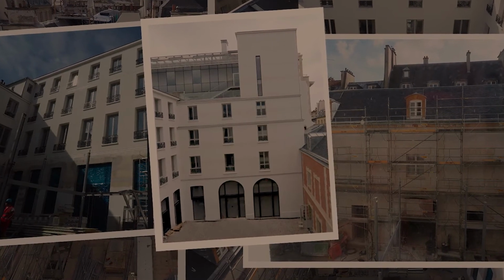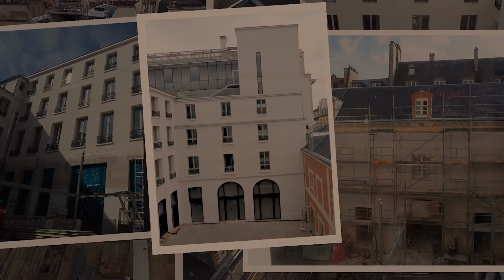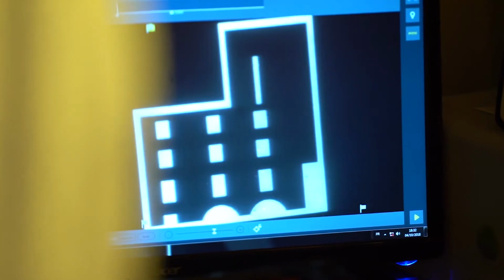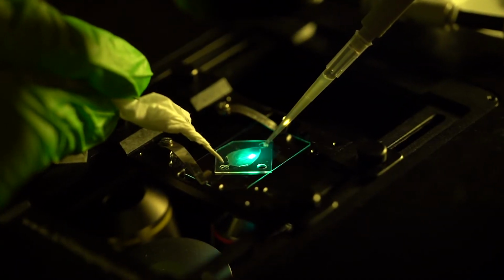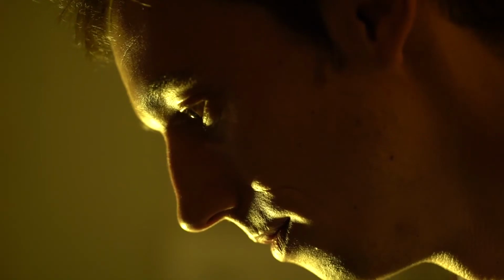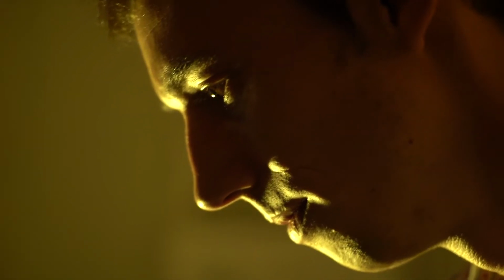First, we miniaturized the building. To that end, we digitalized the shape of the building. We then used a photosensitive resist on which we projected the picture of the building through the objective of our microscope in order to polymerize a master.